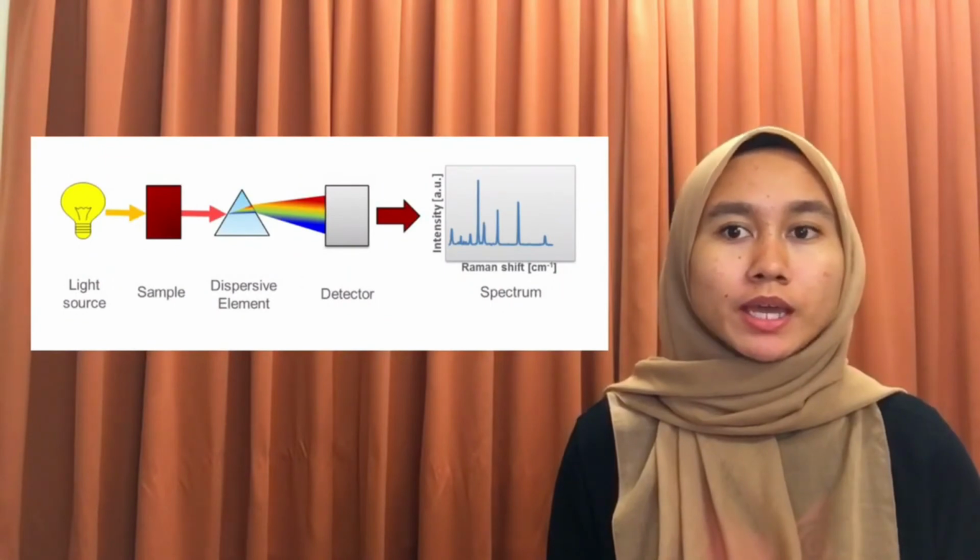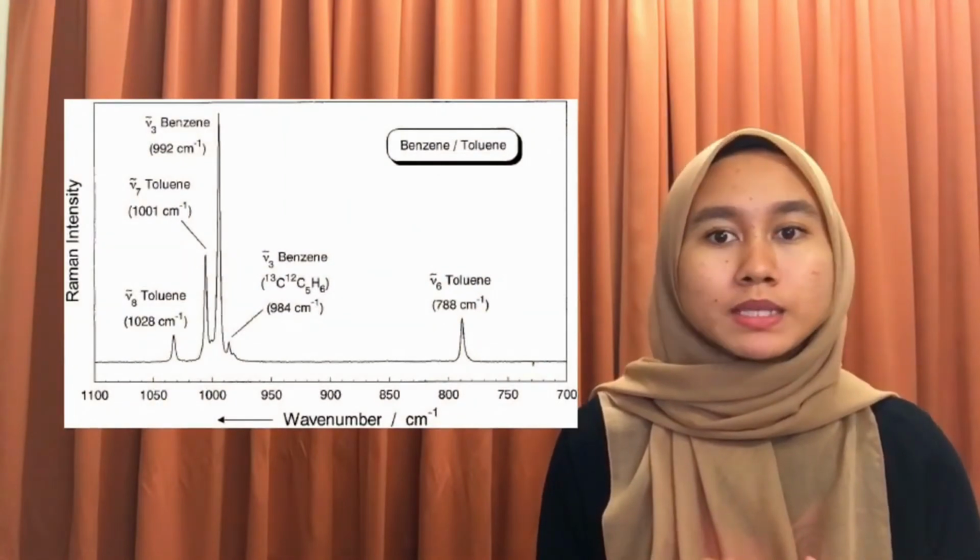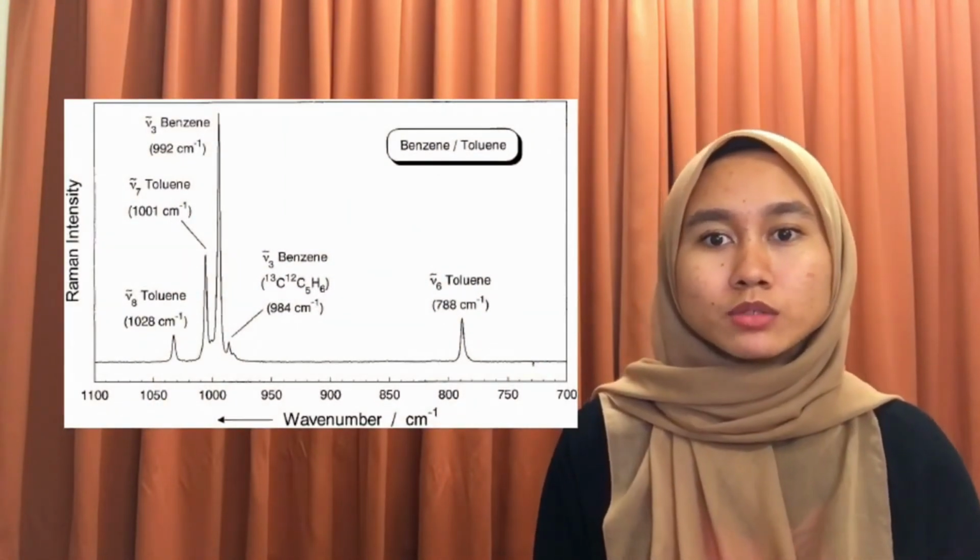In modern Raman spectrometers, lasers are used as a photon source due to their highly monochromatic nature and high beam flux. Lasers used in Raman spectroscopy range from the UV into the near-infrared and beyond. Different wavelength regions offer advantages and disadvantages, with the final laser selection largely dictated by the sample being studied. Some samples can be analyzed at any wavelength with no issues, for example toluene, but for many samples, laser wavelength choice is crucial for high-quality Raman spectra, for example polymers with high fluorescence backgrounds.